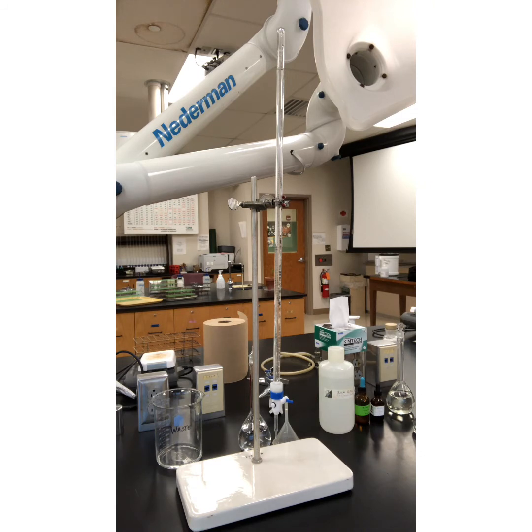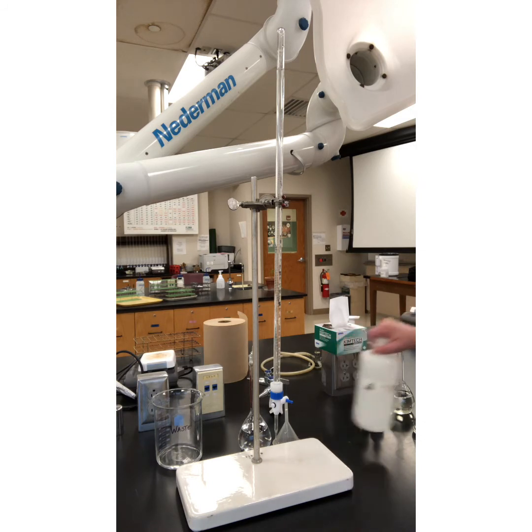Once you find the actual reaction, then you're going to find the concentration of an unknown in part E. Okay, so let's go ahead. I've done my pipetting for 3 solutions. I'm going to add about 5 milliliters of 3 molar sulfuric acid. So I have my 3 molar sulfuric acid.